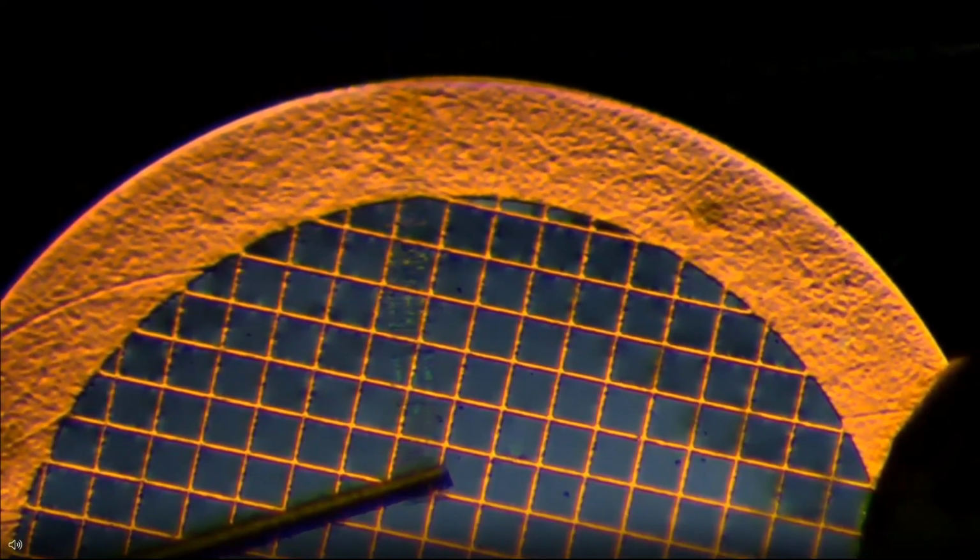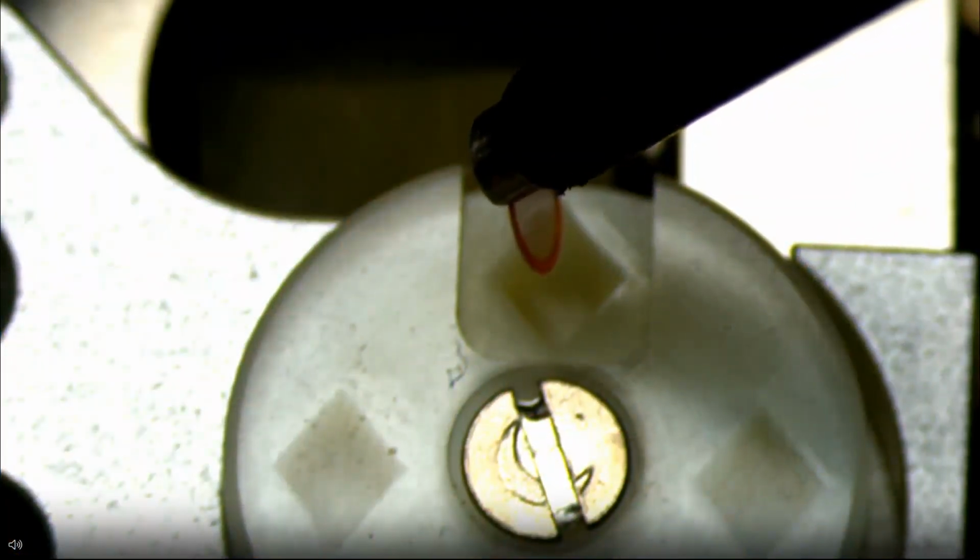There it is. You can see the ribbon is attached to the grid now. The manipulator also can be used to load the grid then into the grid box.